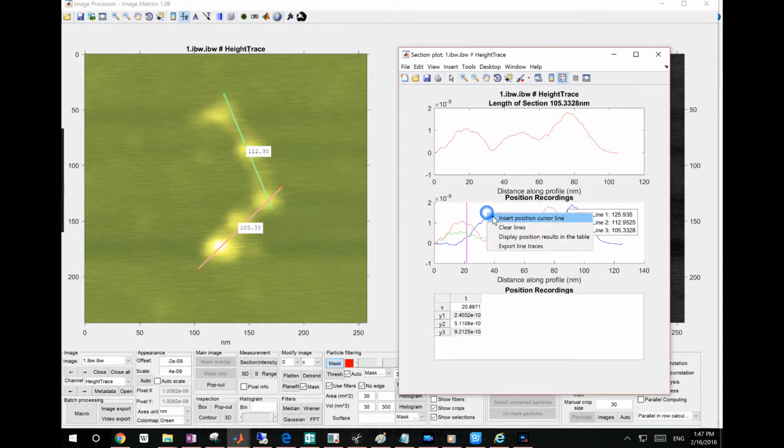So you can add multiple position lines in this plot, and the table below will correspond to the lines you add, specifically to the positions of the lines you add. For example, if I move this around, you can see how the cells beneath the second column move when you move the second line. That means the cells directly beneath this line give exactly the location of the line that you're moving. What if I try a trick?